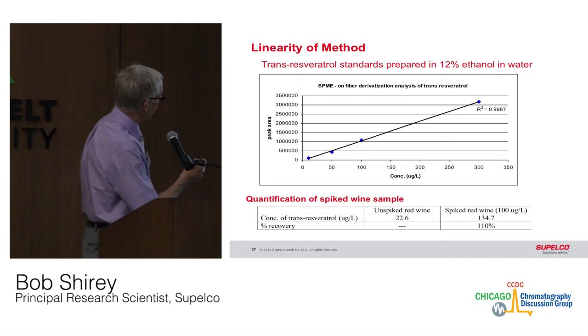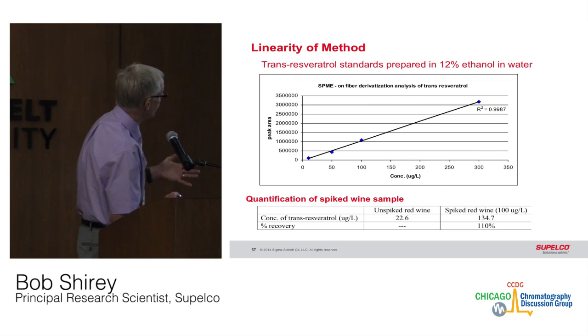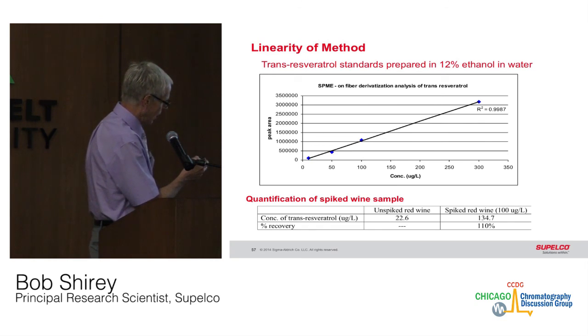Again, we see the calibration curve. Instead of spiking the wine, we just spiked 12% ethanol to get the calibration curve. It seemed to work pretty well.